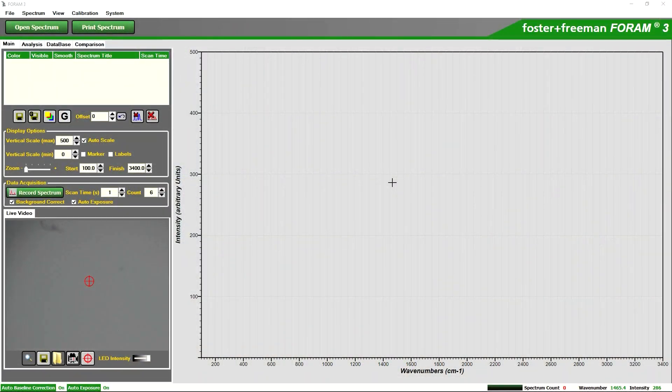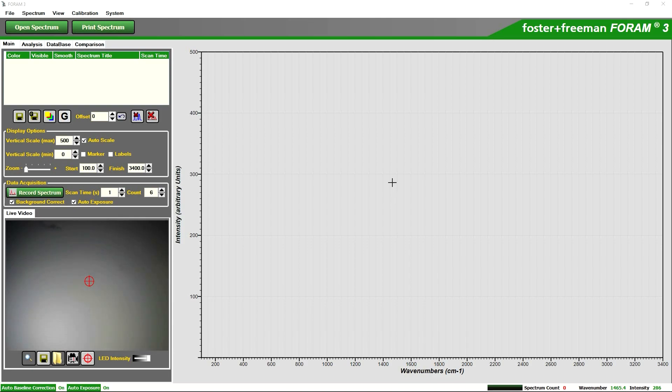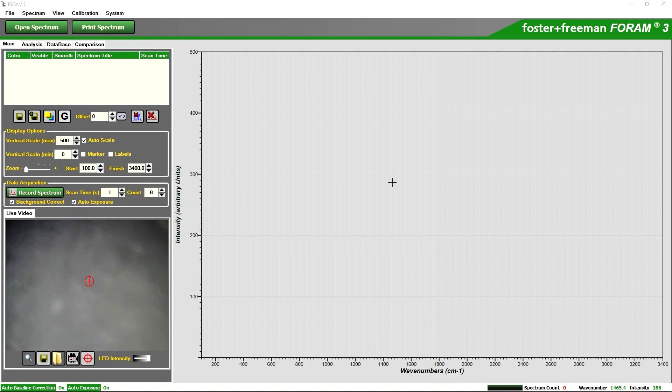First we will move the stage up to focus on our sample. Here first we have the bag itself and I'll just focus in slightly so we are obtaining a spectrum from the powder inside.